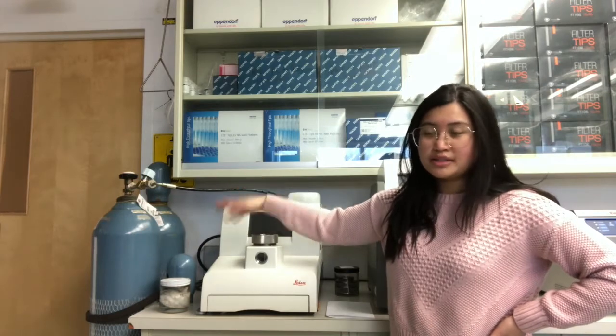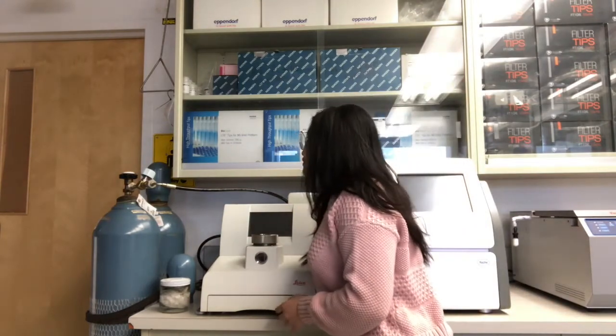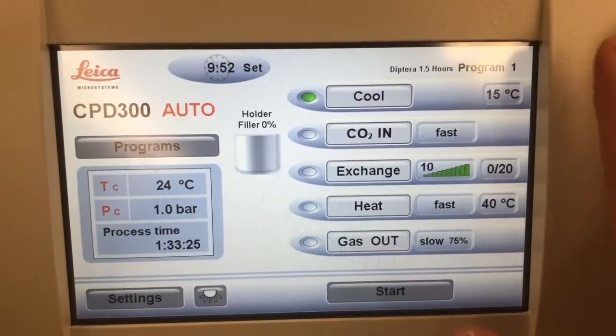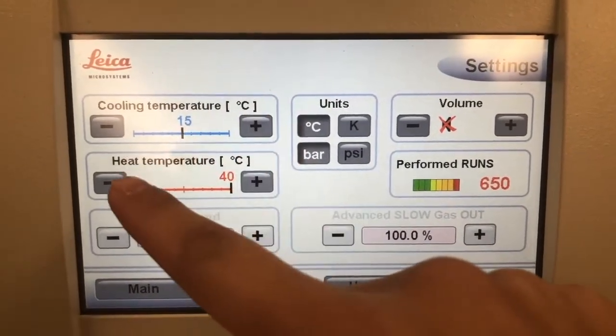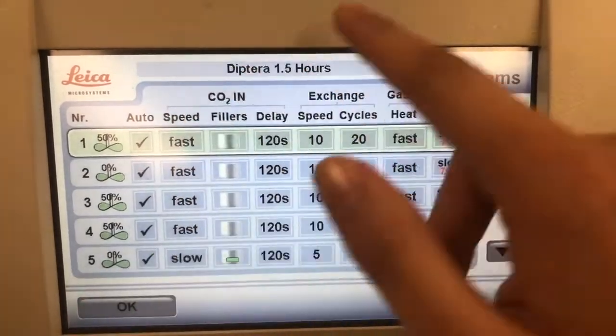We also have two valves on our CO2 tanks. The extra valve means that when you're switching mid-run you can close all of them and switch into the new tank so the pressure and CO2 in the CPD machine won't drop or run out. Now I'm going to turn it on - the switch is on the back - and it's going to bring you to a start screen. After the start screen it should bring you to a main screen, so first things first go to Settings.